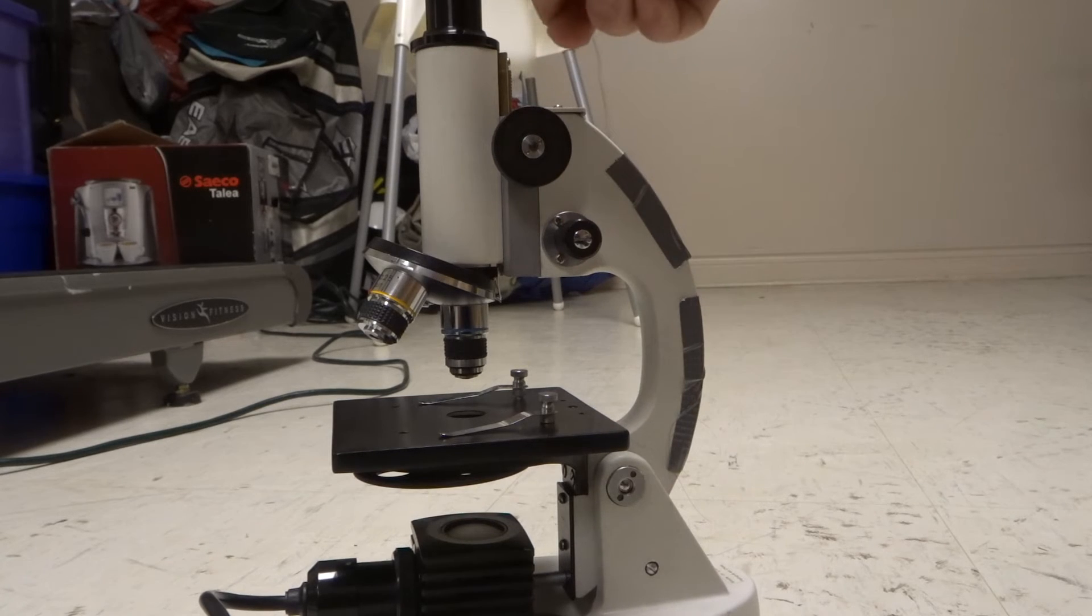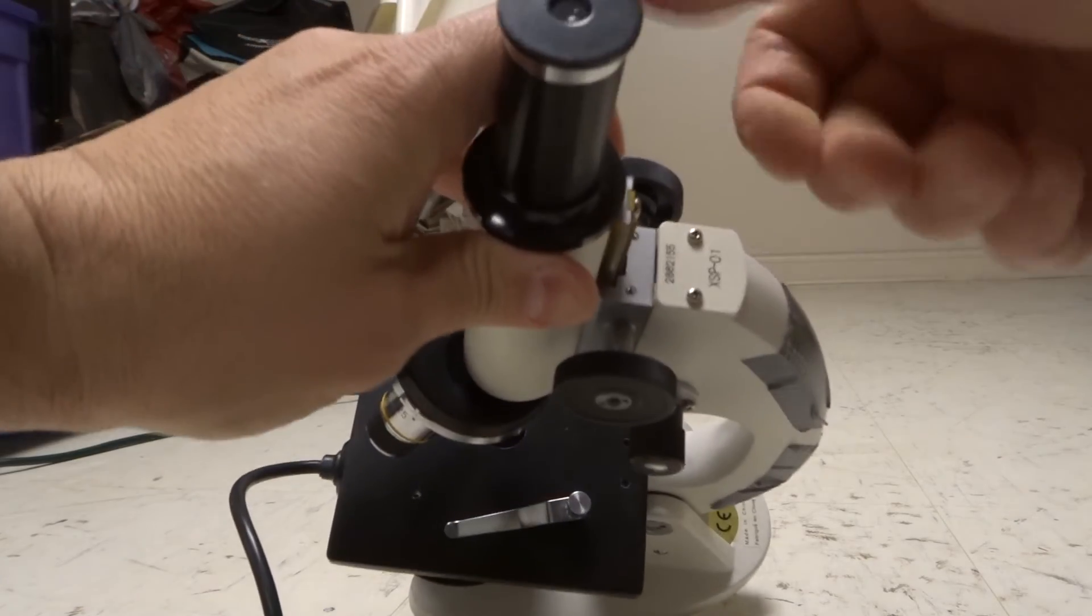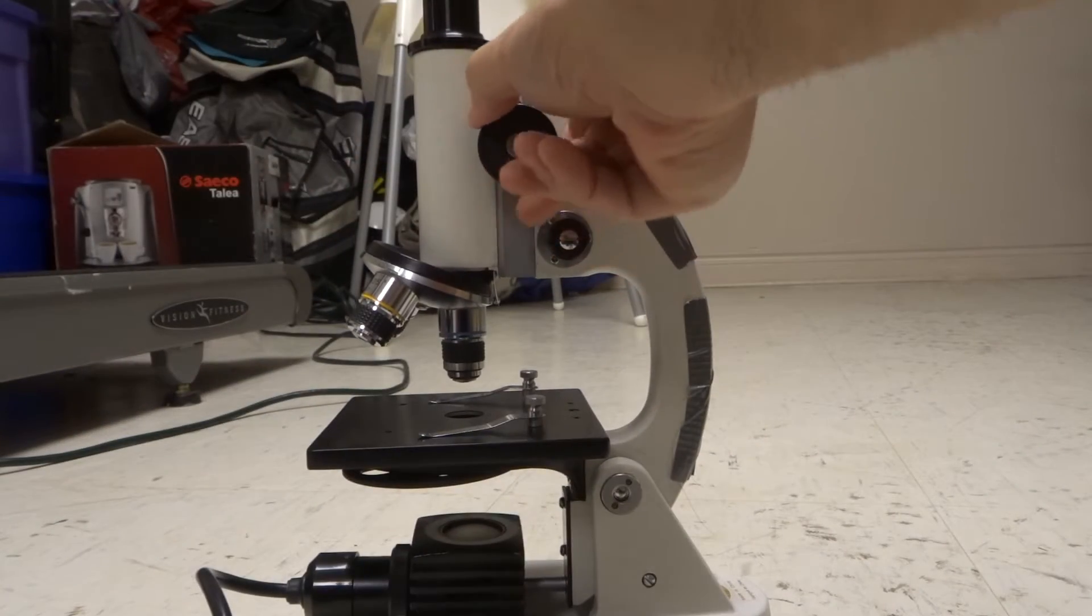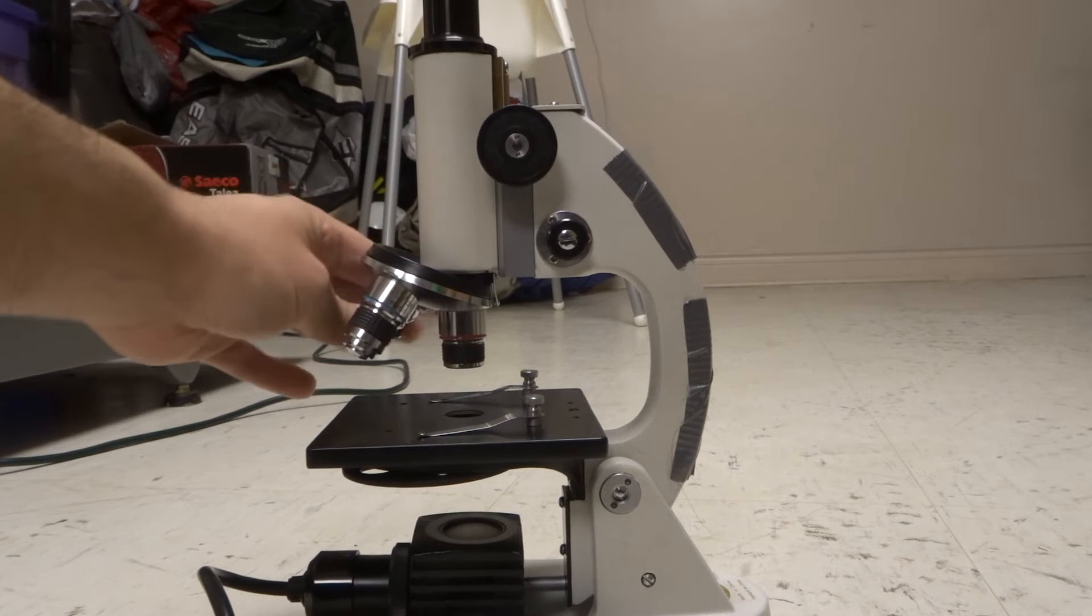So what you want to do is first and foremost, look through the optical lens, the ocular lens up here. And you want to adjust the coarse adjustment knob. And obviously you want to choose your objective lens.